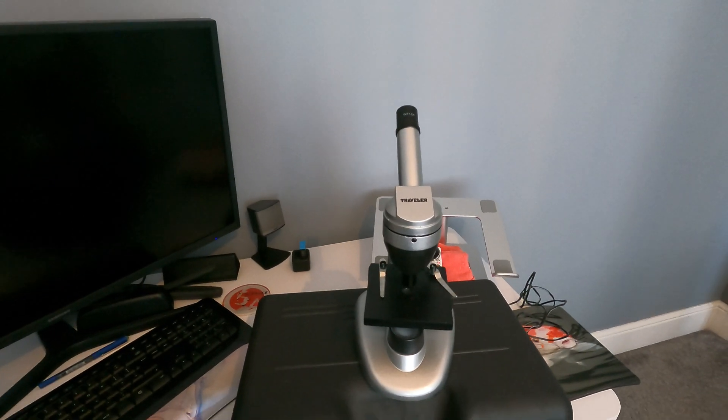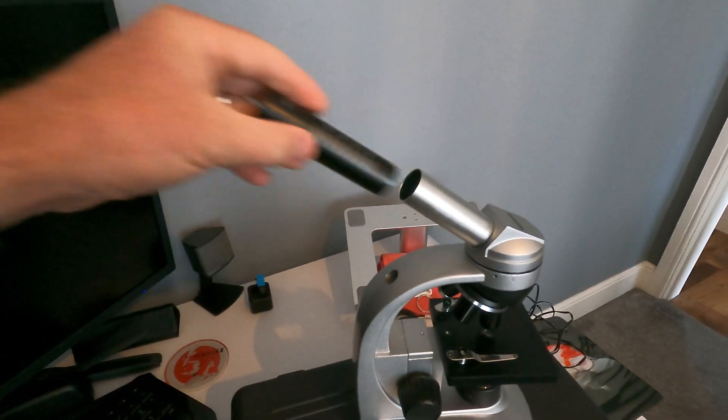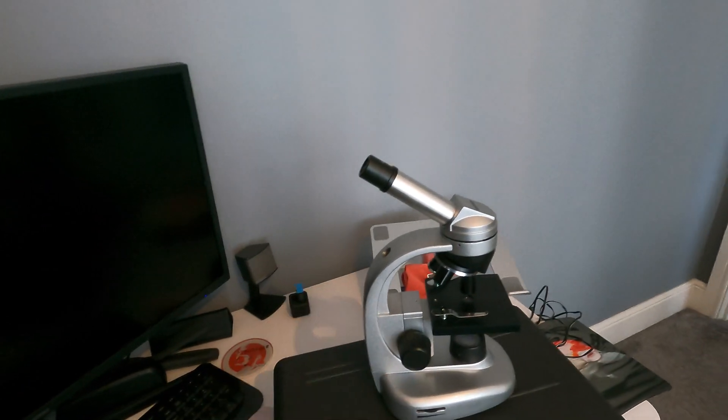We've got access to two microscopes in our house. We have one that we've had on permanent loan from Grandpa for quite some time — this Traveller one, believe it was from Aldi or Lidl. It's done the job for some time, but it did have a camera that you could watch on your PC screen. The drivers were for Windows 98 or Windows XP and they don't work with anything more modern. It's got a few problems — any slight movement and it's straight out of focus.